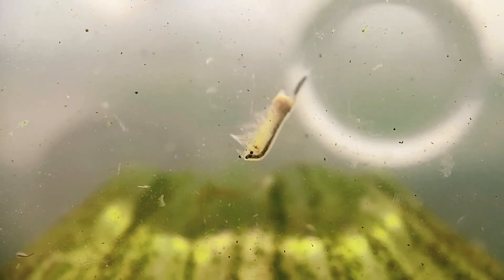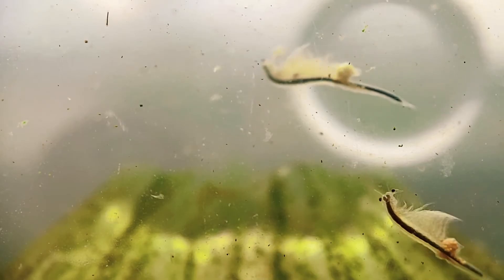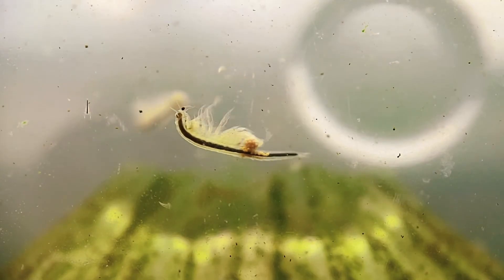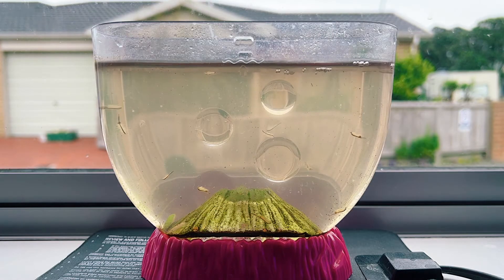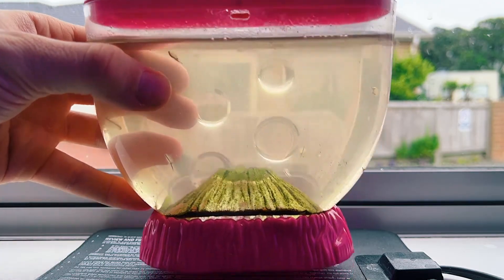The videos you've been looking at here are all shot with a 10x optical zoom macro lens, and that's because sea monkeys are very small animals — the largest adults here being no more than 1.5 centimeters or half an inch in length, and the tiny babies are only a fraction of that at around 1 millimeter long. Despite their small size their bodies are beautifully detailed, but it's hard to really appreciate how cool they look when just watching them swimming in the tank or even with this macro lens. So let's take them over to the microscope where we can have a look at them in slow motion and really get an appreciation for the fine details of their anatomy.